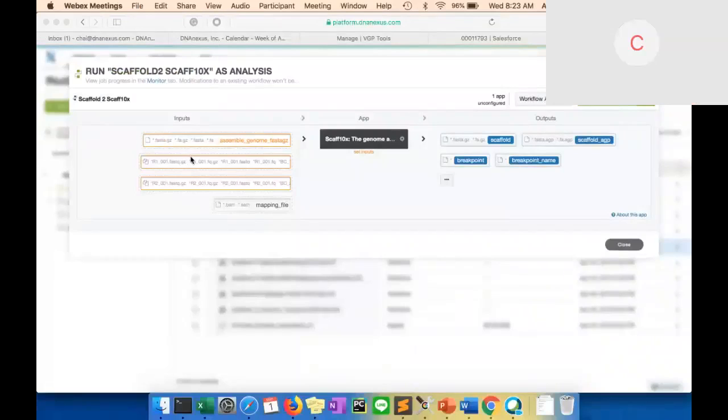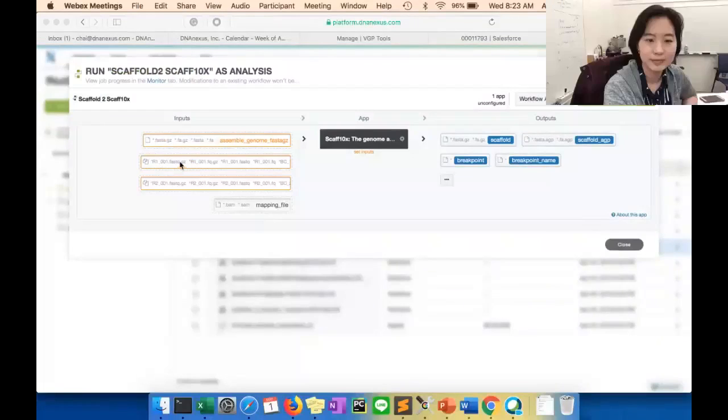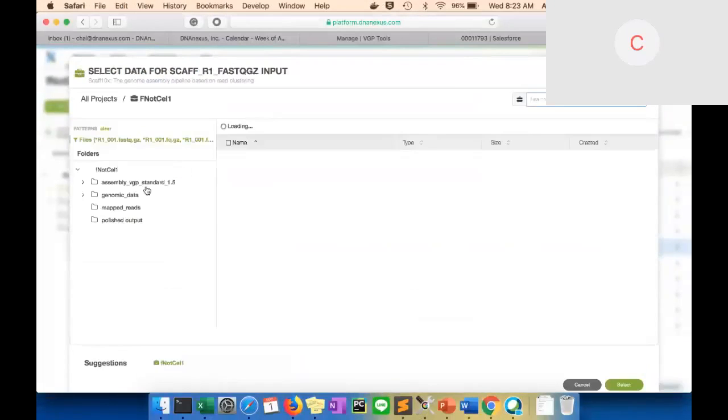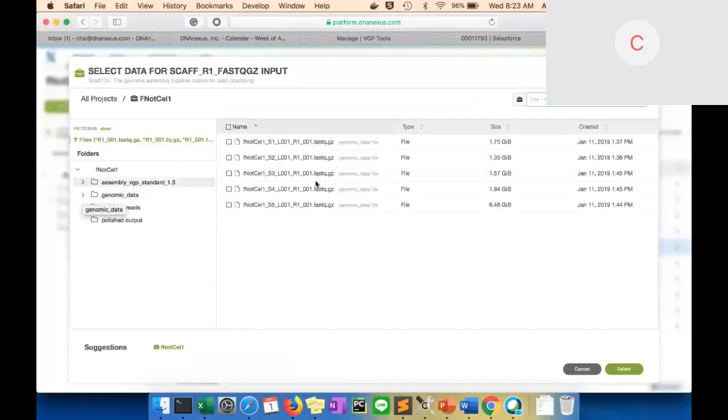Sounds good. So, first of all, you all might see in Arang's slide that there is a recommended way that we can name the 10x input here. I just want to mention that sometimes the data that got uploaded a long time ago didn't have the same kind of naming here. If you click on this app and try to find the input, you can see that there are some suggested inputs that already have the matching name pattern here.